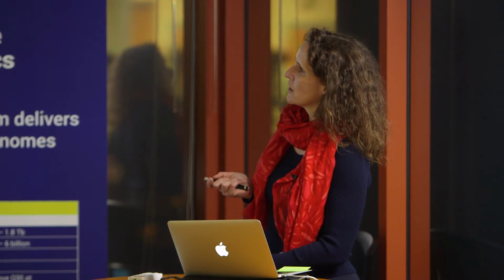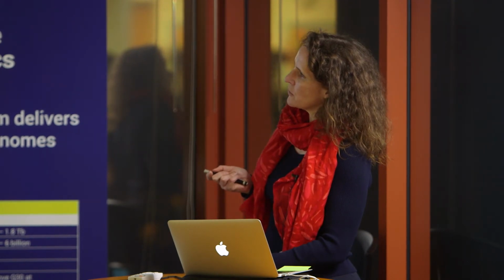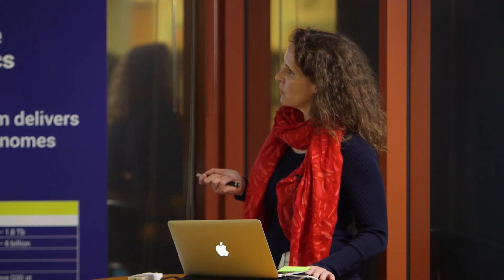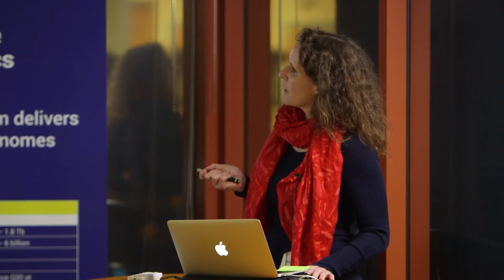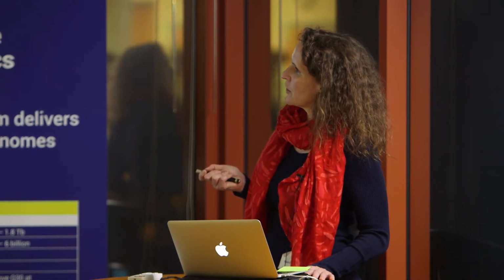What you see on the left side is the theoretical mass pattern of one of those peptides. In black, which you can barely see, is the mass of the peptide. In red is the peptide carrying one carbon-13 isotope, and in green, the second carbon-13 isotope. So in mass spectrometry, we don't see one peak, we see a peak with isotope patterns. And when we know the sequence, we can predict what the ratio of isotope patterns should be. What you see on the right side is a peptide in very noisy data. There is a mass that fits the right mass, but the isotope ratio is not right, so we exclude this. But here was a peptide that has a mass that is dead on, and an isotope ratio that seems reasonably good. But it's noisy because it's very, very low abundance.